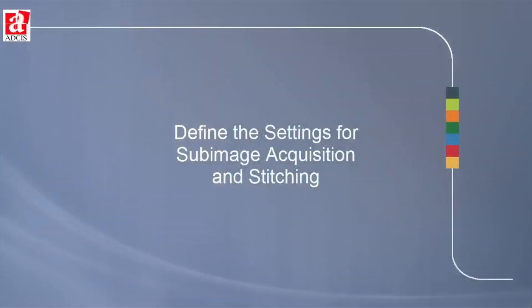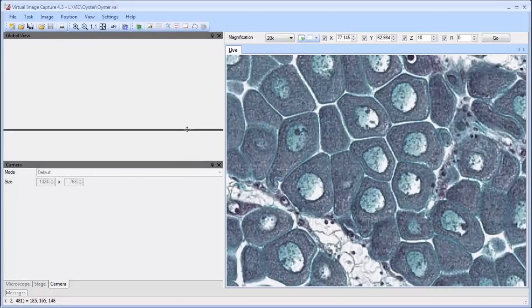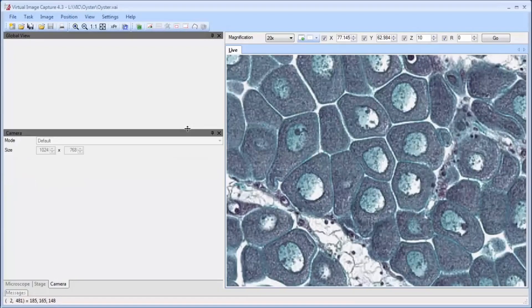Next, we define the settings for sub-image acquisition and stitching. By removing some of the border pixels of acquired images, some optical distortions due to lens aberration and illumination can be removed.